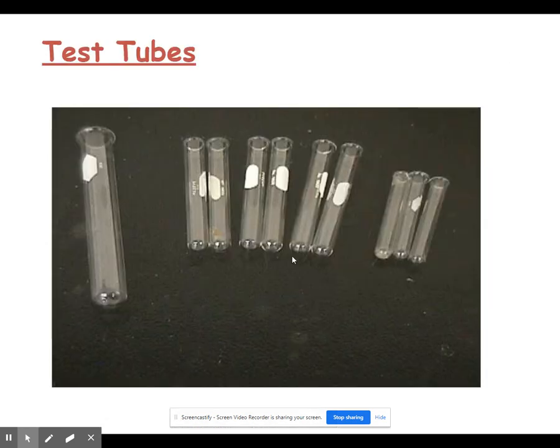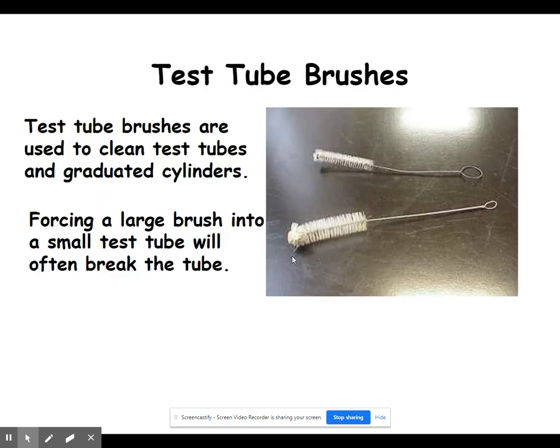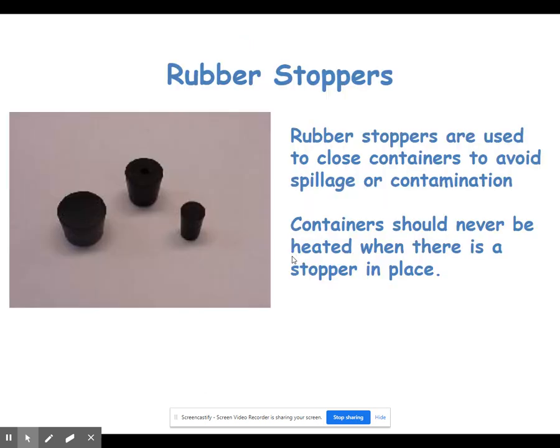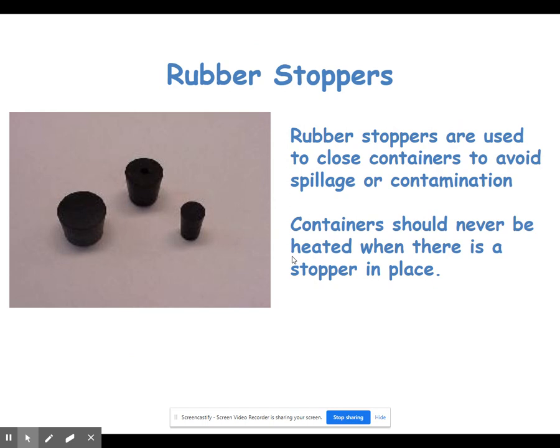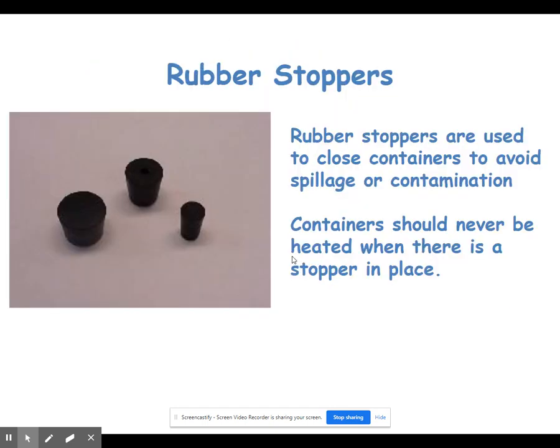Test tubes are used for various reactions throughout the year. A test tube holder and test tube brush are pretty self-explanatory, as are test tube racks. Rubber stoppers are typically used to stop up a test tube. One important thing to note: any time you stopper a test tube, you should never heat that test tube — the pressure will blow the stopper out and it'll shoot across the lab.